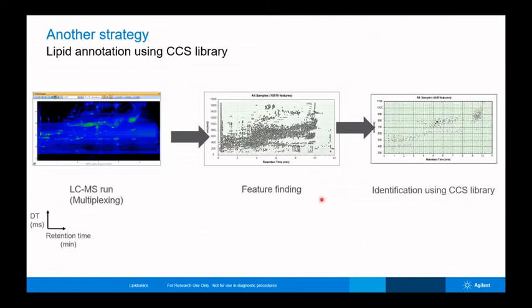One of the last finishing steps for me was the separation using the ion mobility approach. As I said, it sits well in terms of separation in the order of milliseconds, compared to the chromatographic separation in the order of seconds and the QTOF acquisition speed in the microseconds. The ion mobility gives another dimension, another piece of information about each of the analytes, which is the collisional cross-section of each of the molecules being analyzed. And this correlates with the structure of it somehow.